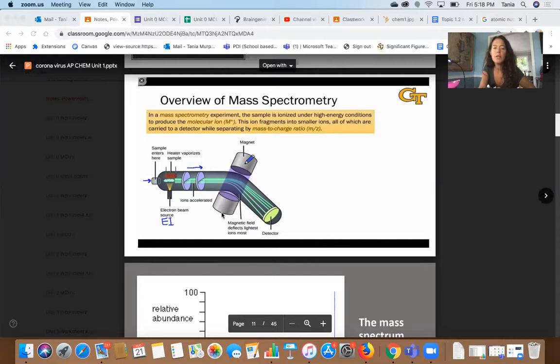This would actually be the negative side, I know that, and I'll explain to you in a minute. And this would be the positive side. And what we see is that these ionized particles are being separated based on their mass, such that the lightest particles are deflected more. And that makes sense because it's easier to pull something light to you.